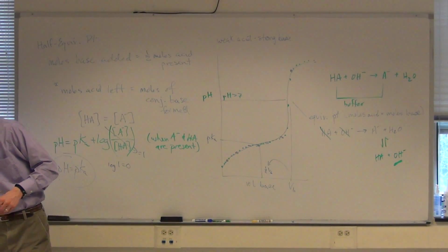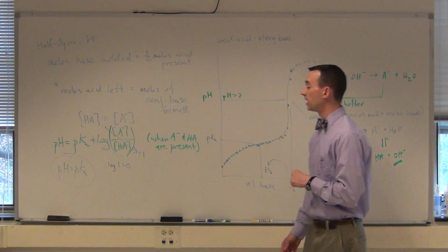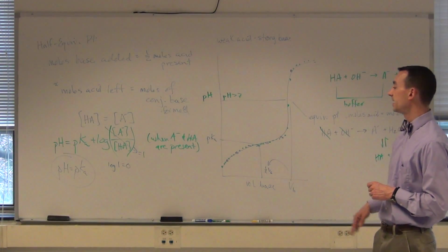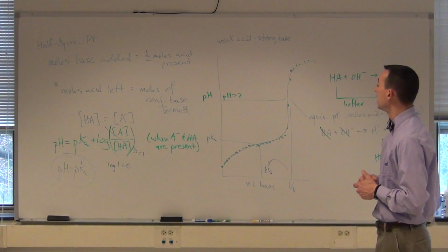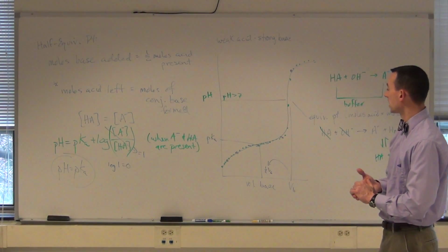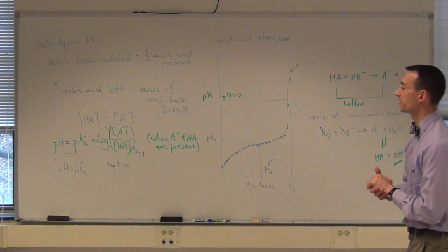Okay. A couple of other things that I've mentioned during the pre-lab discussion relate to some of the discussion questions at the end of the lab. In particular, again, this half equivalence point and what it is, and also I believe there's another question that I've addressed. If you paid attention, you'll find that when you're looking at your discussion.